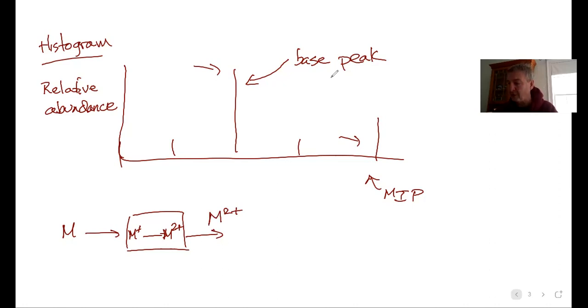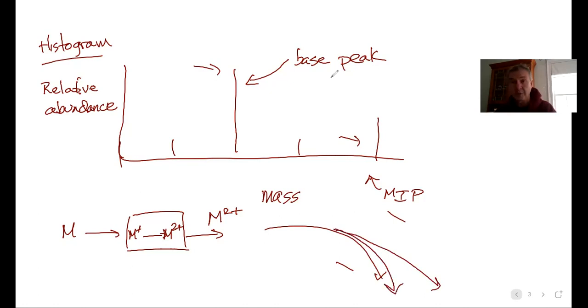Now, as it heads towards these magnets, when it's accelerating, it's got twice the charge and it's twice as attracted, so it's being pulled twice as fast. In other words, it's not just mass that matters, and it will deflect twice as hard. It's also charge. It'll deflect relative to its mass, and it'll deflect more, meaning sharper around that curve, depending on its charge. So as charge goes up, mass goes down. In fact, it's mass over charge.